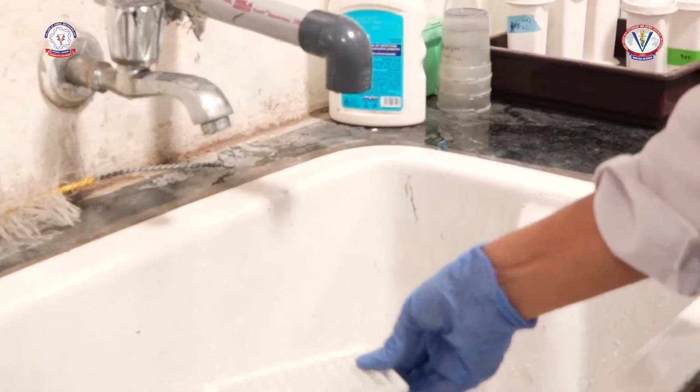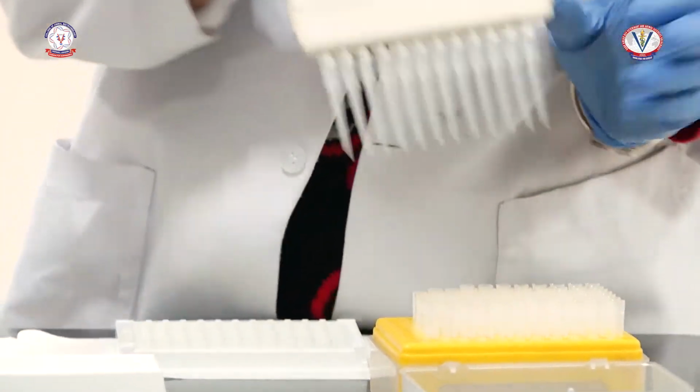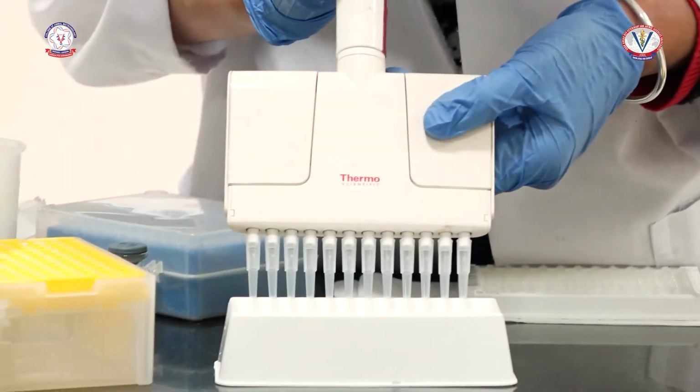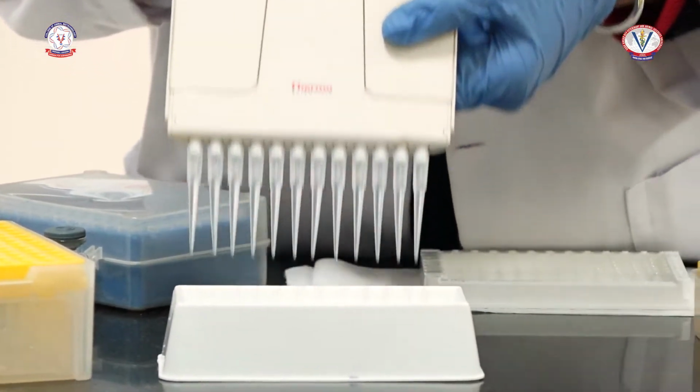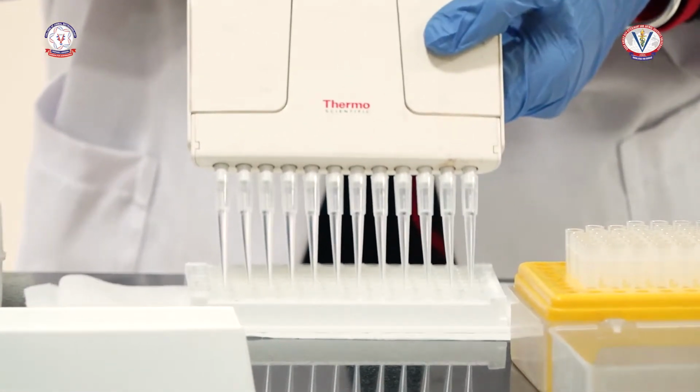The next morning, empty the plates, and then blocking is done by adding 150 microliter blocking solution in each well.